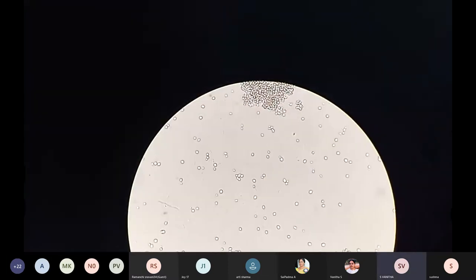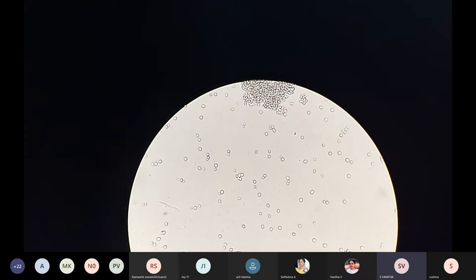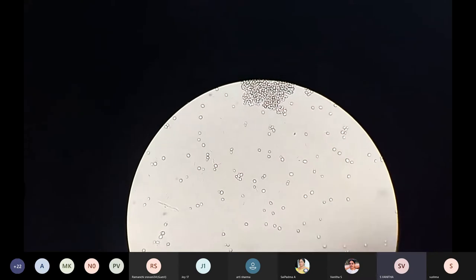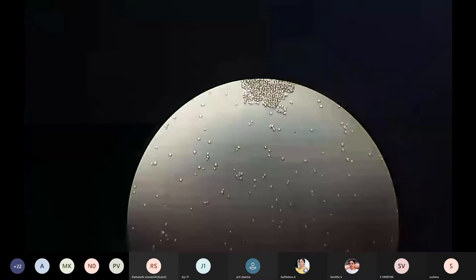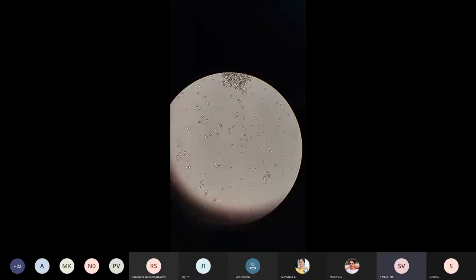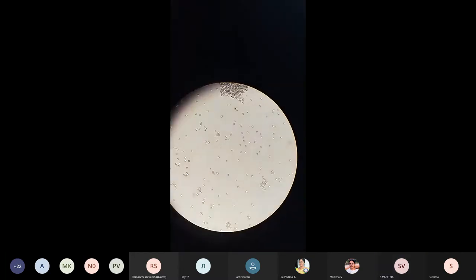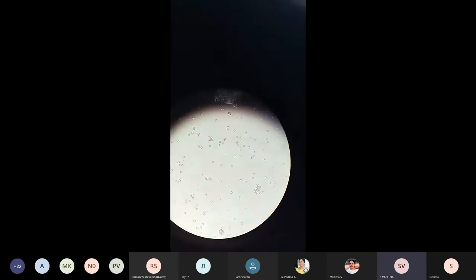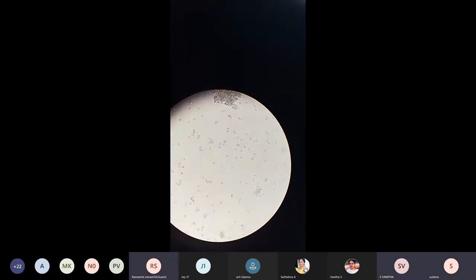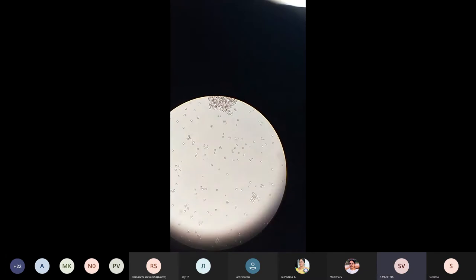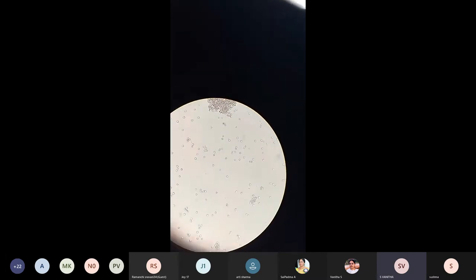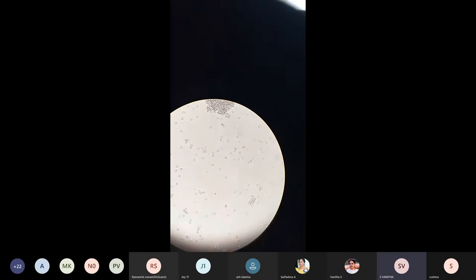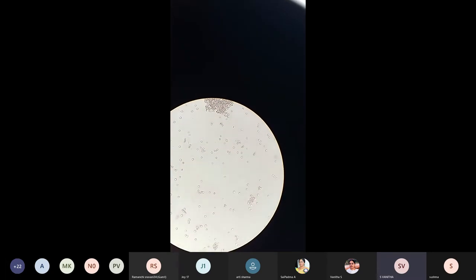Are you able to see students? 40x. This is in 40x. You can see now. Are you able to see it? So you can see some here and there, some budding are also there. You're able to see. 100x you can adjust. 100x? I'll see. Yeah, I'll try in 100x also.